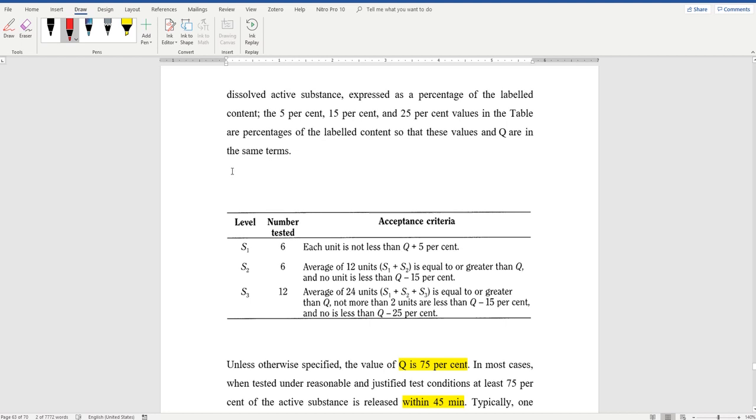Okay? So how many samples did you draw, if that's your experiment? In this case, you will have the sample in one tube, another sample in another tube, third tube, fourth tube, fifth, 6 tubes. So you'll put your 5 ml or 10 ml that you drew from each vessel inside the tubes. So now you have 6 tubes containing a sample from the dissolution medium.